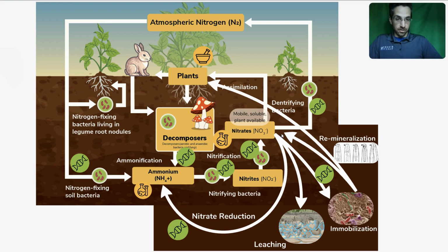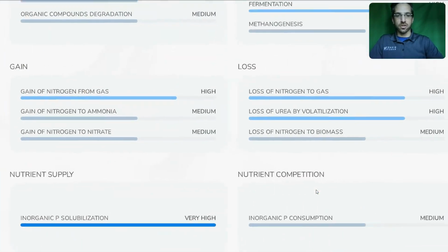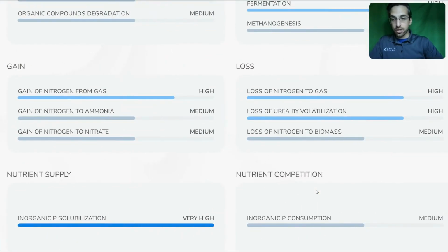Makes sense. There's also microorganisms that all have their own needs for nitrogen. Every living organism needs nitrogen. And so there is a pathway where microbes are taking up nitrogen that might otherwise be available to a plant, and that's called immobilization. So let's look real quick. On your report, you'll see 6 nitrogen pathways. We have the supply lines you could think of as provision.